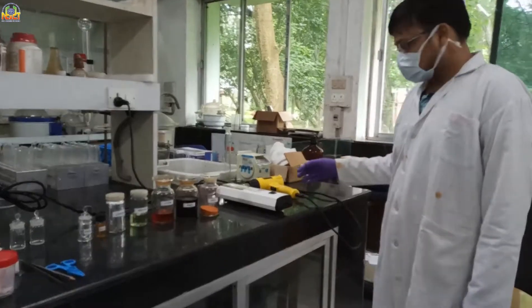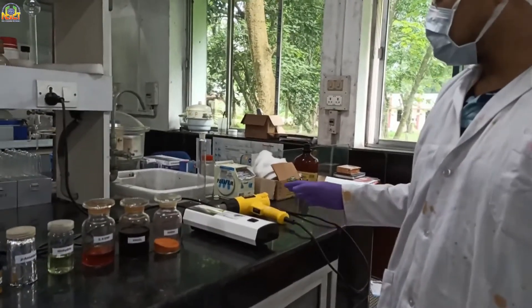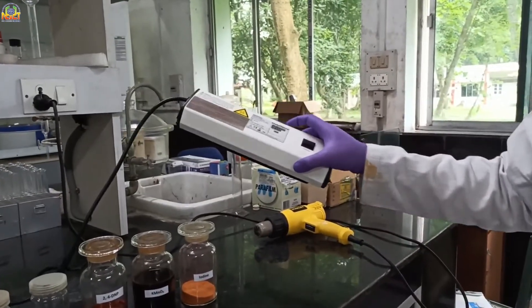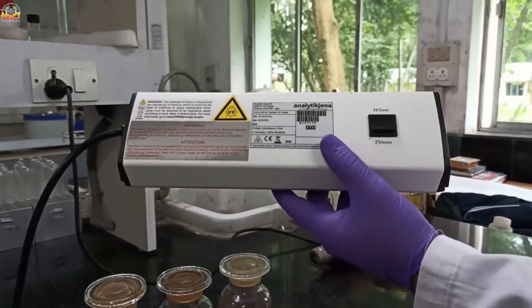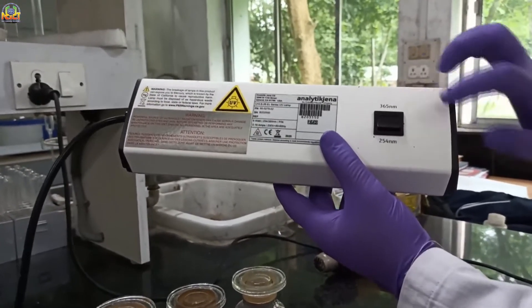So what are the materials required for this demonstration? This one is a portable UV light, which has two types of tube lights for wavelengths 365 and 254 nm. One is for short wave and one is for long wave.